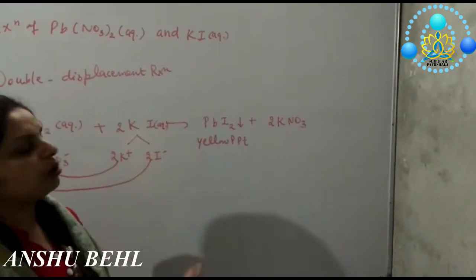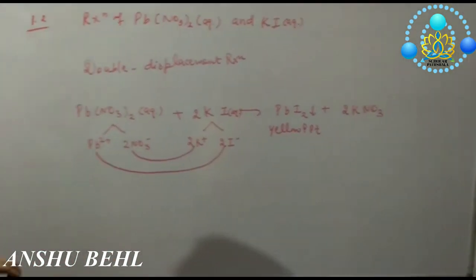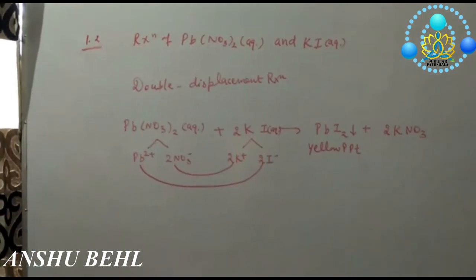This reaction is also termed as a precipitation reaction. This was your activity 1.2.